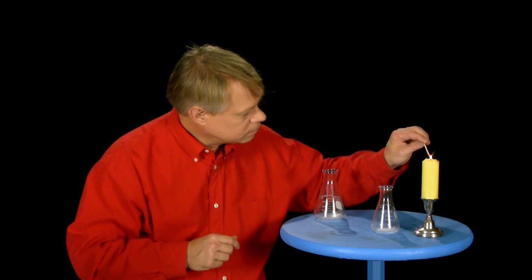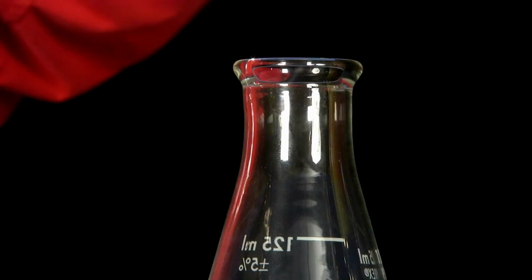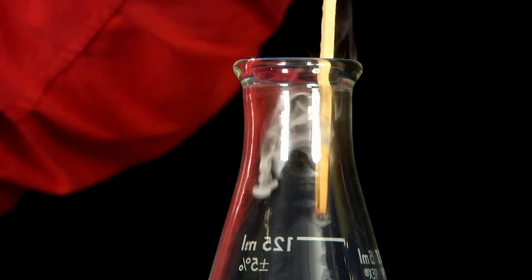I wonder whether any has gone in or not. I cannot tell by the appearance, but I can in this way. It extinguishes the flame. If I were to examine it by lime water, I would find it by that test also.